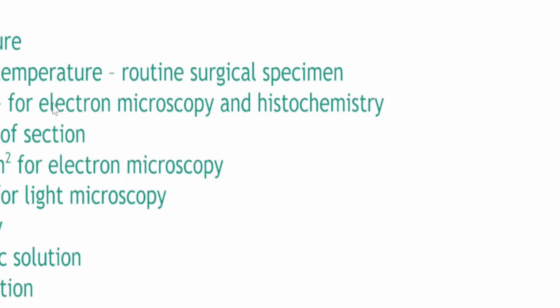the concentration in relation to the freezing point of the particles within a particular solution. So it's supposed to be isotonic. Your solution, your fixative should be in an isotonic solution. Why? If it's hypertonic or hypotonic, it will cause the cells to have morphological degeneration. And the concentration, of course, is that for most samples in histopathology, we use formaldehyde and it's concentrated at 10%.